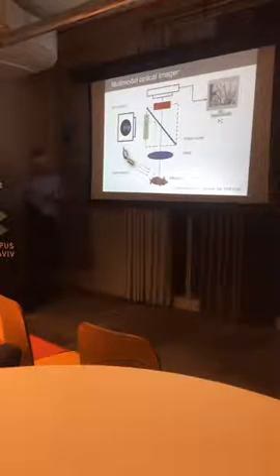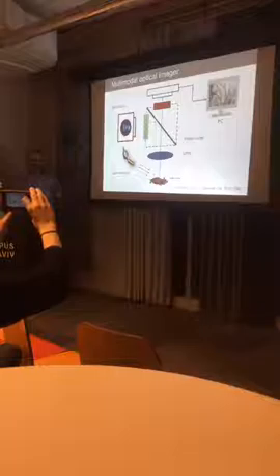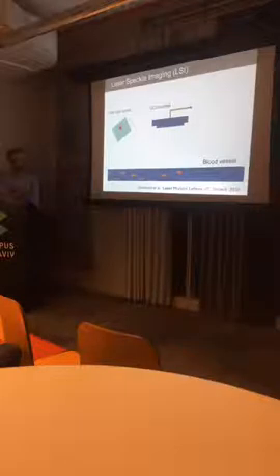Let's start with this. It's clear for fluorescence, but I will start with how we can use laser speckle imaging, using the laser to get information from the biological tissue, from the organism. So this is, let's say, a blood vessel with red blood cells, the laser source, and a CCD camera.